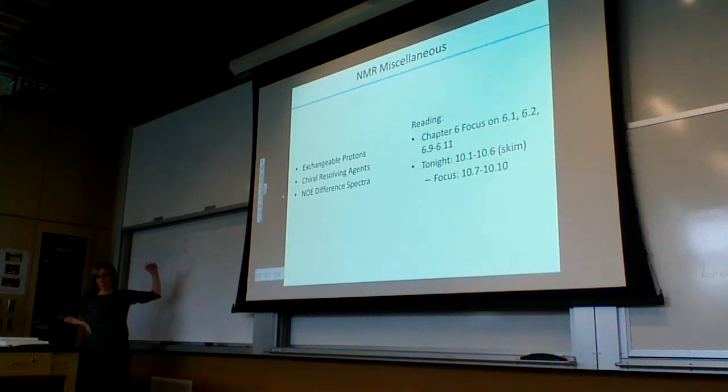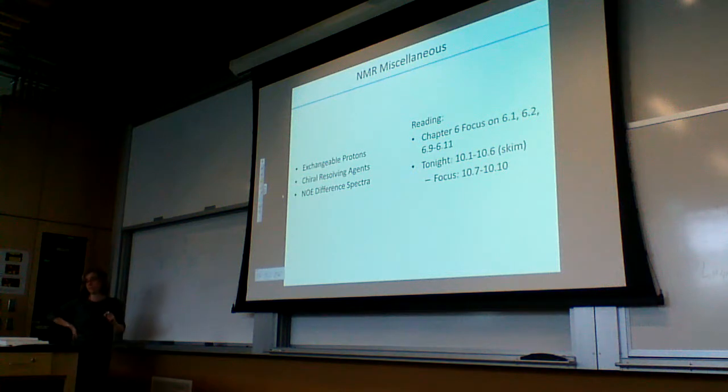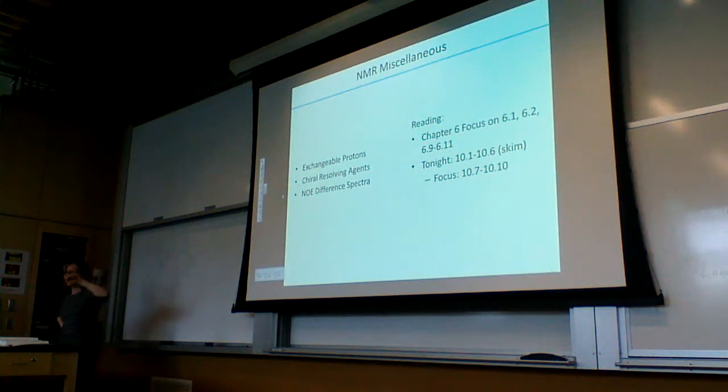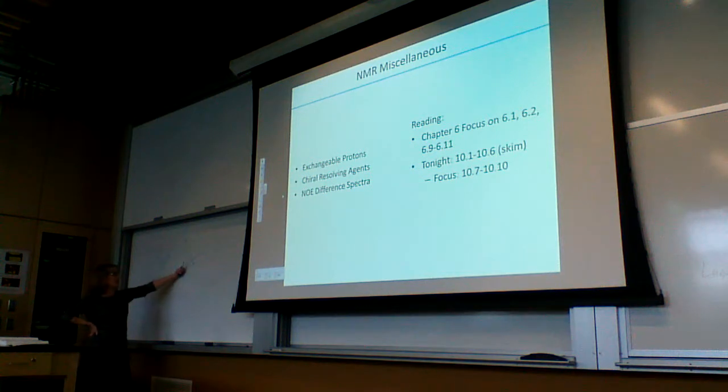So you're saying that the single hydrogen is split twice? So far, this one is split twice by these two hydrogens. Or once for each of the hydrogens, I should say, more clearly. And so this hydrogen splits it once, and this hydrogen splits it once. But in this case, because there is no stereo center, it splits them the same way. And that's where we would get our standard triplet.